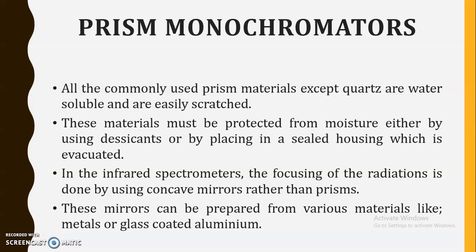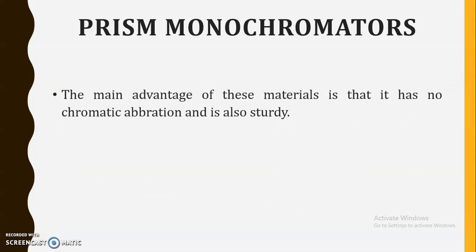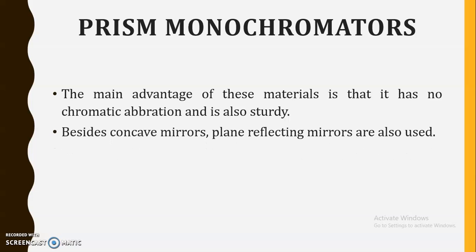As we have seen in the working also, two different types of mirrors are used, either flat mirrors or concave mirrors. Concave mirrors are made up of various materials like metals or glass that are coated on the surface with aluminum. The main advantage of these materials is that they have no chromatic aberration and they are also sturdy. Besides concave mirrors, plane reflective mirrors are also used in the prism monochromators. So this is about the working of prism monochromators.